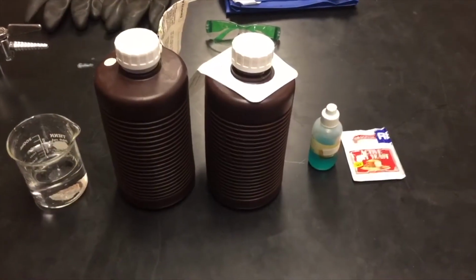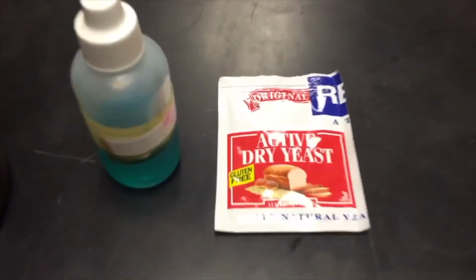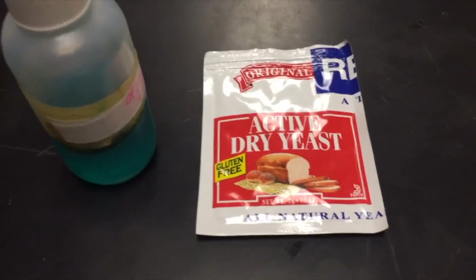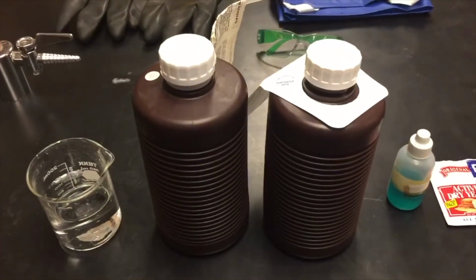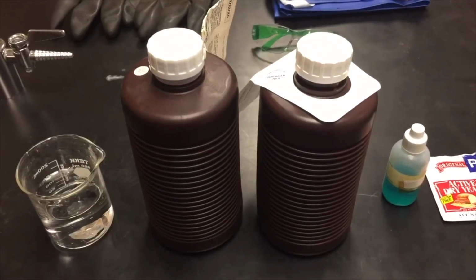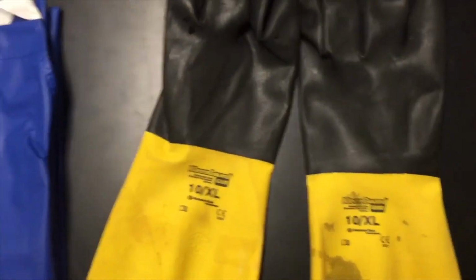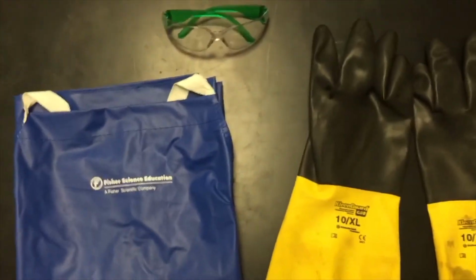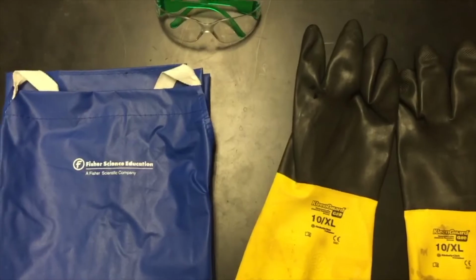In our reaction, we will be using various different substances. We will be using 6 grams of dry yeast, a couple drops of dish soap, 300 milliliters of 30% hydrogen peroxide, and we will be using 100 milliliters of water. For safety, we need aprons, goggles, and gloves to handle the 30% hydrogen peroxide, which is much more concentrated than the hydrogen peroxide you find at the drugstore.